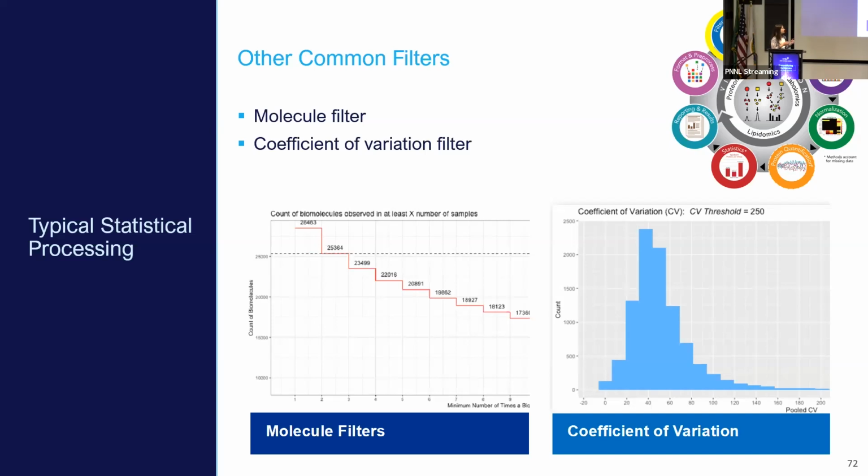So if we want to go beyond those proteomics specific filters, there are a couple of other options that are used sometimes. So one of them is, instead of just removing those one-hit wonders, we might want to have a little bit more confidence in what we're seeing. So if we want to require that a peptide is seen in at least 3 samples out of all of ours, right? We could impose that sort of a filter and get more stringent with the peptides that we're retaining.